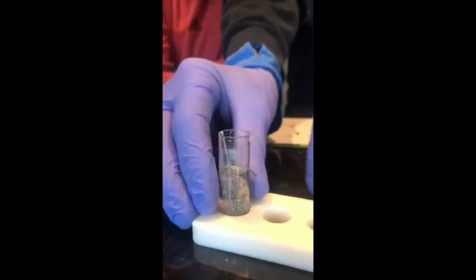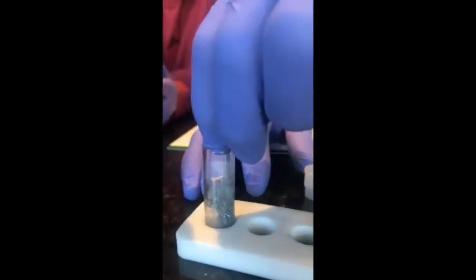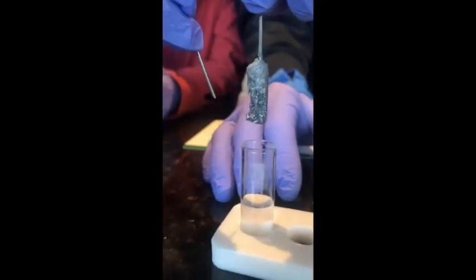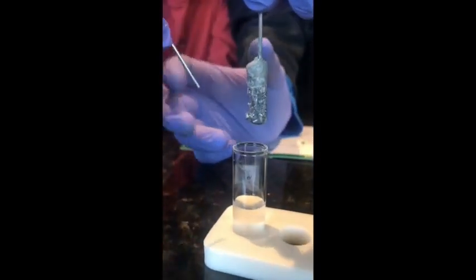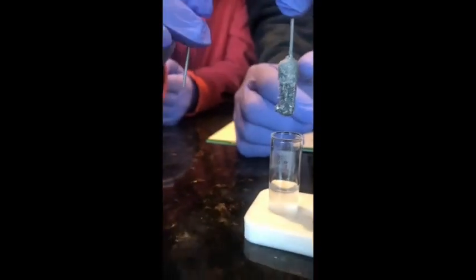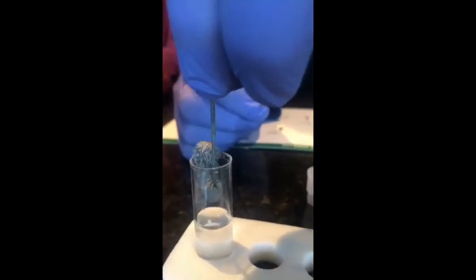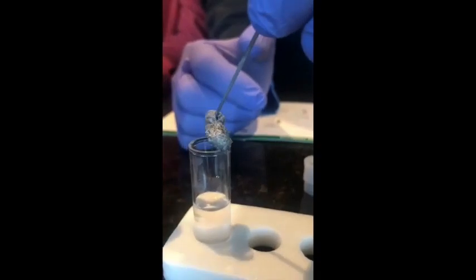And the second comparison is the piece of zinc with the sodium hydrogen sulfate mixed with the tin 2 chloride. Duncan's going to hold his up against mine. And there is the start. Please don't touch them, because we've got to use those for another experiment. Okay, and that is the end product that has been formulated as a result.